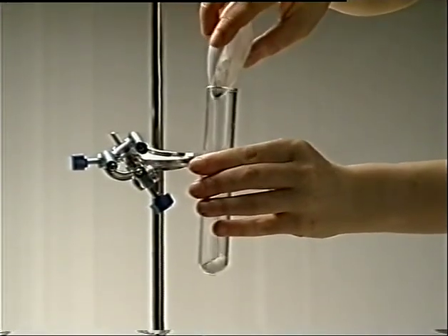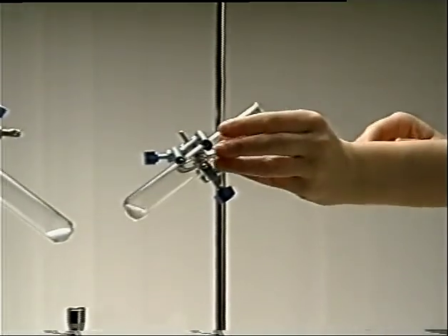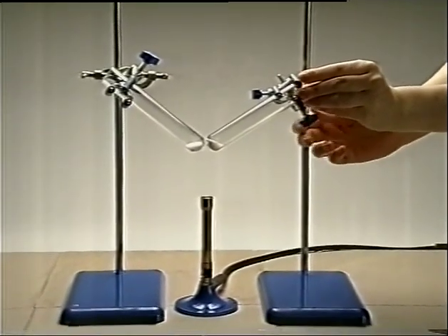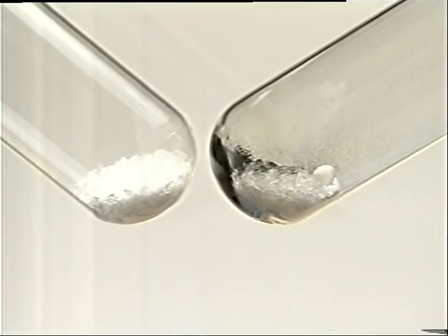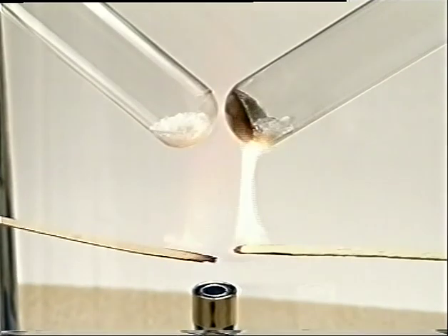It acts as a catalyst in the thermal decomposition of potassium chlorate. The tube on the right contains the catalyst, the one on the left doesn't. As the potassium chlorate is heated, it decomposes and gives off oxygen.